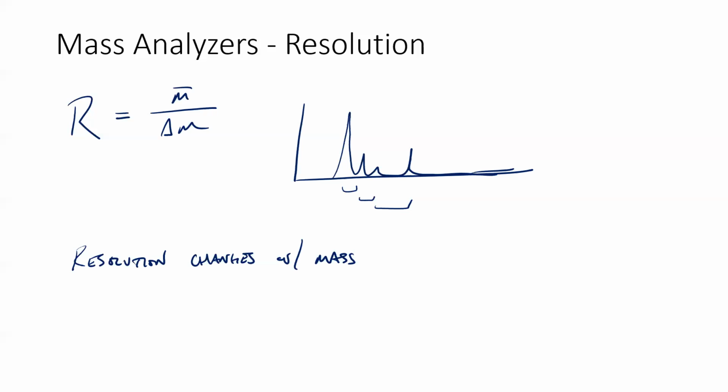The one we're not talking about is one mass analyzer because it's on our list of possible topics at the end of the year. And that's the FTICR, so Fourier transform ion cyclotron resonance mass spec. It's a mouthful, but it's the highest resolution out there, right? And it's a neat instrument in that it can measure both positive and negative ions simultaneously. And so there's a spectrum, and I've looked for it, and I can't find the paper that it's in, but I saw it when I was in grad school taking a mass spec class.